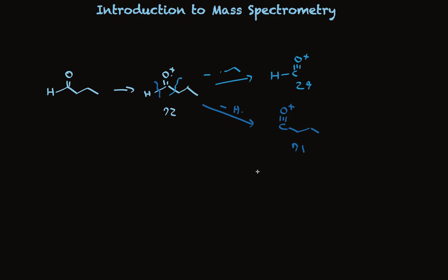One last example. See how easy it would be to determine whether the carbonyl group of a ketone was at the 4th carbon over or the 3rd carbon over? The fragmentation adjacent to the carbonyl here would lose an ethyl group. On this side would lose a butyl group. The fragmentation adjacent to the carbonyl here would lose a propyl group, and hey, would also lose a propyl group. So the weights of the fragments would be distinctly different. Mass spectrometry, an extremely powerful tool for identifying organic structures.